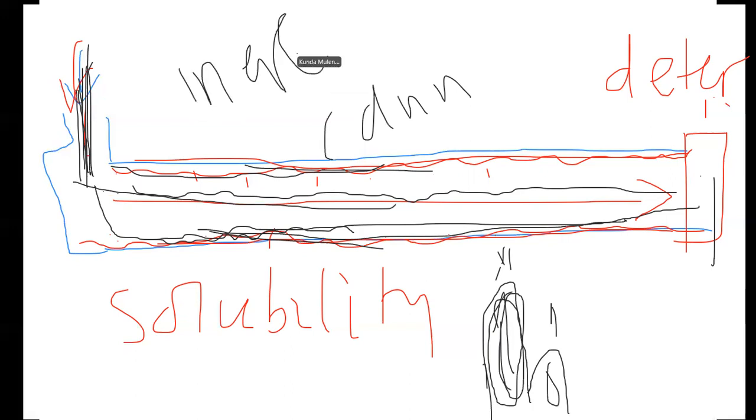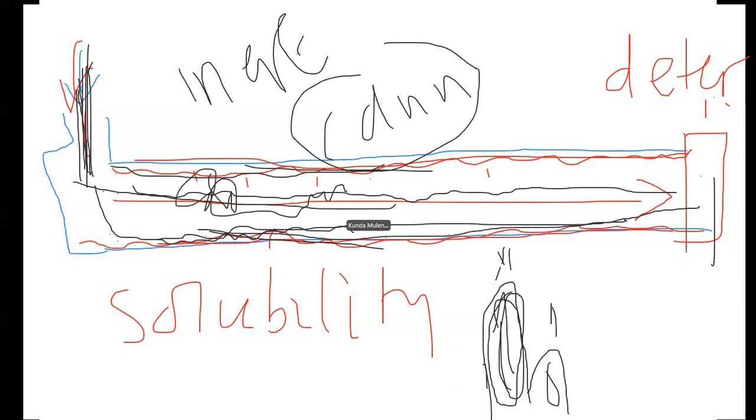Why can't we use another gas like oxygen? Why can't we use it? The reason is because if we use a gas which is very reactive like oxygen, it might end up reacting with a lot of these components that are in here. And at the end of the day, you form a complex. Let's say you have carbon in here. Carbon is able to react with oxygen, and then you produce carbon dioxide, which you did not intend. In case you had hydrogen, it reacts with oxygen to form water, and then water mixes with this solvent here. It might not even reach the detector.